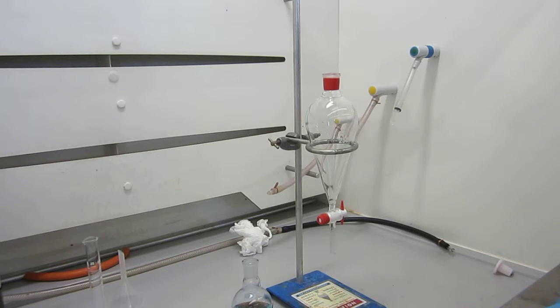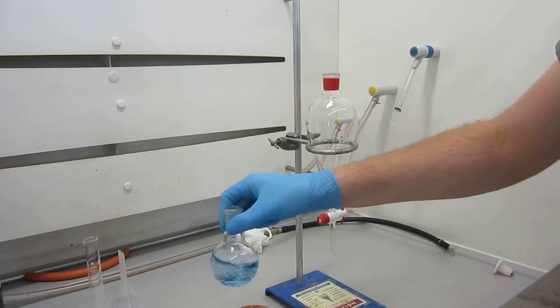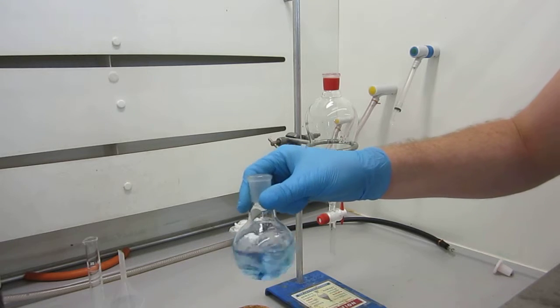This purification requires the knowledge of partition coefficients and knowing which solvent your product is going to prefer to go into, and you need to understand miscibility and how to choose which solvent is going to be appropriate for your extraction. So for this demonstration we've got a mock-up reaction mix here where we have, in an organic solvent, ethyl acetate, we've done a reaction which has produced a water-soluble product which is blue in colour.